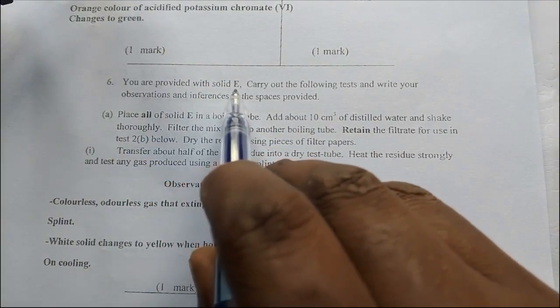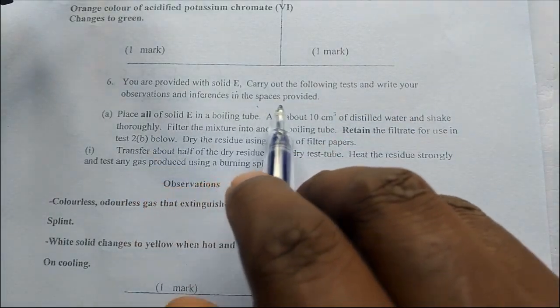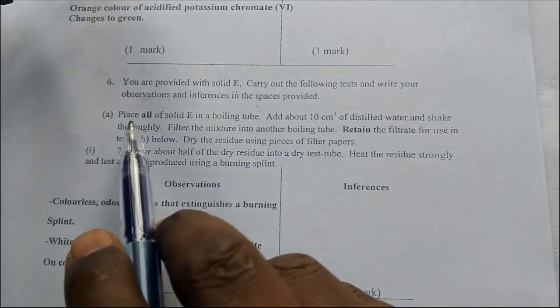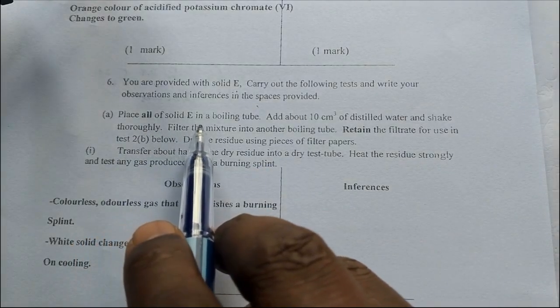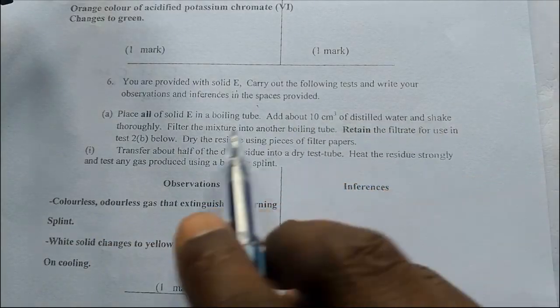You are provided with Solid E. Cut out the following test and write your observations and inferences in the spaces provided. Place all of Solid E in a boiling tube. Add about 10 cm³ of distilled water and shake.